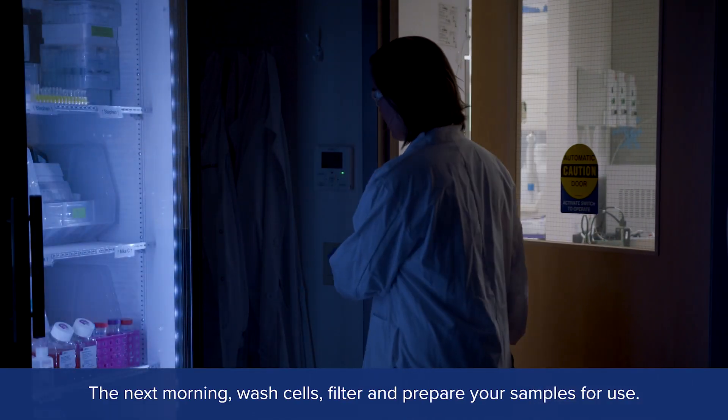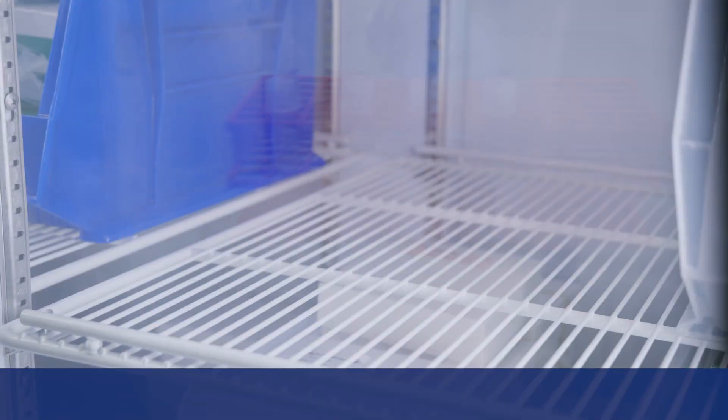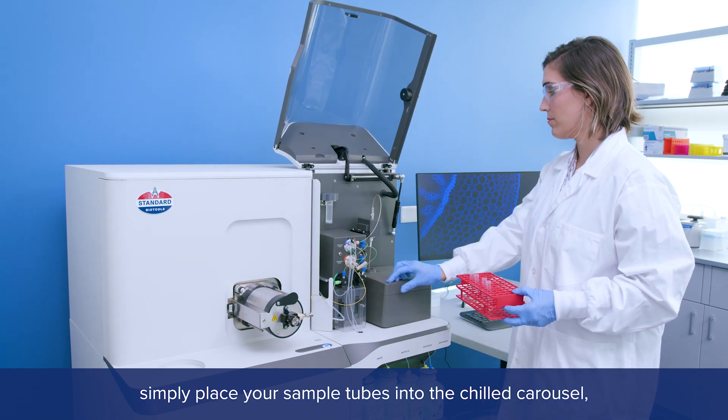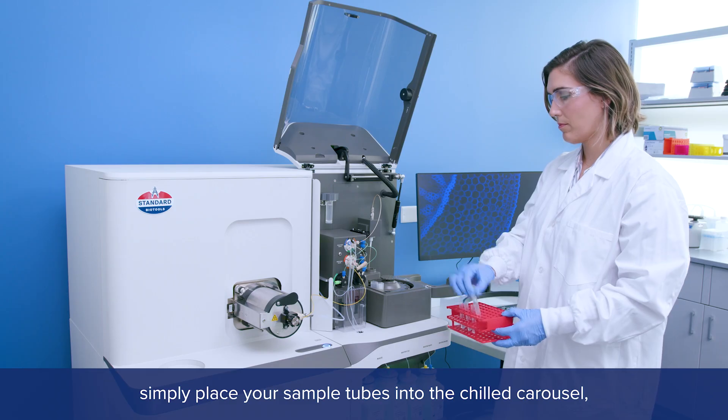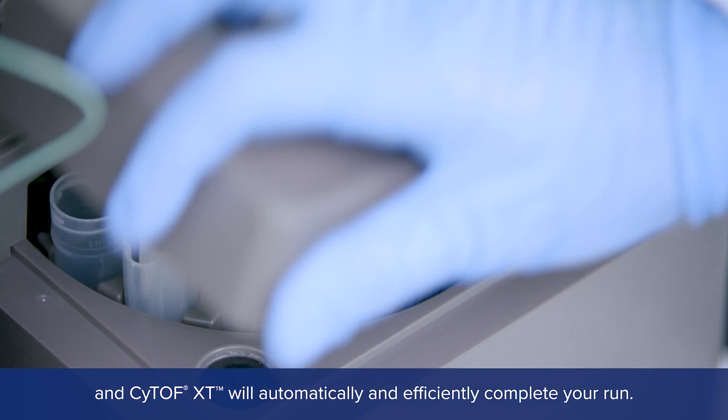The next morning, wash cells, filter, and prepare your samples for use. To acquire your data, simply place your sample tubes into the chilled carousel, and CyTOF XT will automatically and efficiently complete your run.